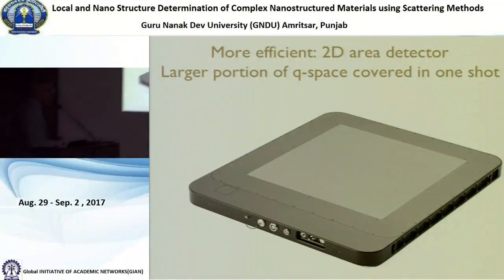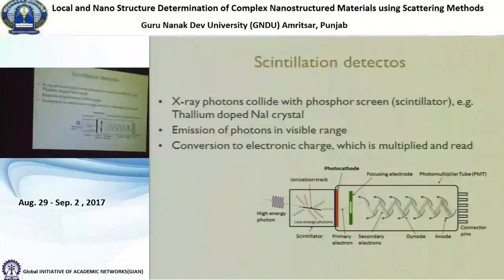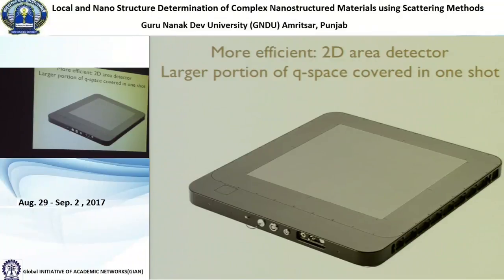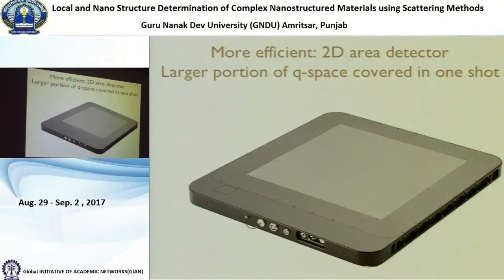There's a detector called Pilatus, which has this photon counting technology. It uses cadmium telluride material to collect the charge. This is a high atomic number, high Z material, so it's good for hard X-rays. So we're getting very good efficiency in a photon counting detector. It's being built into devices that are this big, and they currently cost somewhere between $5 and $10 million for one device. But the price will come down.